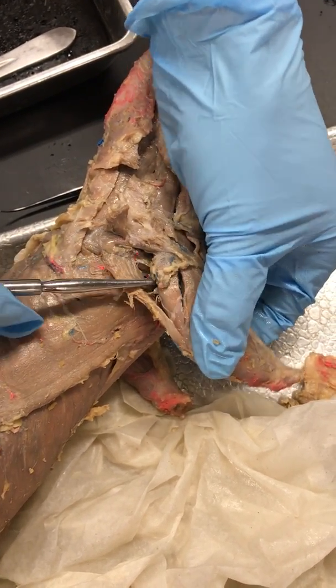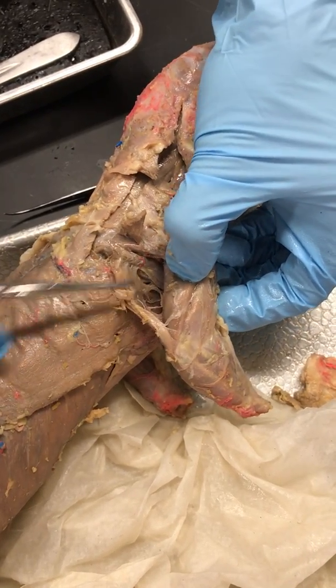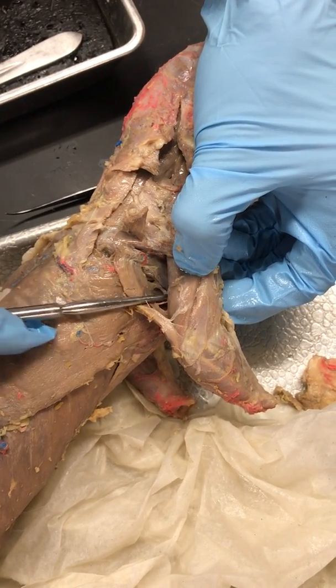Between Scapulodeltoid, Dorsal Epitrochlearis, and Infraspinatus there's another muscle called Teres Major. Teres Major is going to go under the arm — a lot of times you can see it going down under the arm and it gets bigger as it goes down there. That's Teres Major.